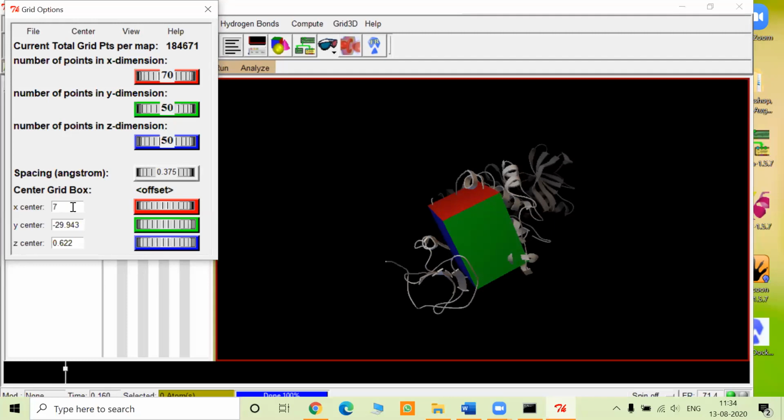I will share this manual with you. You can download this protein and this ligand from the center, which I'm going to share with you later, and you can try to do them by yourself also, because the manual is self-explanatory. You can see the manual and do it. You can experiment once, and later depending on your convenience you can check it out and try it. So I have defined the parameters. I will show you the binding energy at the last.